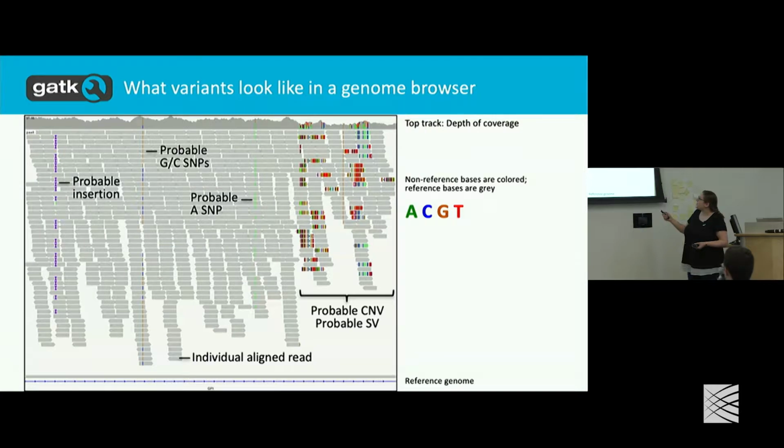You can also see that the coverage drops in this region a little bit. We're going to see that read coverage is a pretty messy signal, and so we're going to do a lot to clean that up, but this could be a deletion as well at this site.